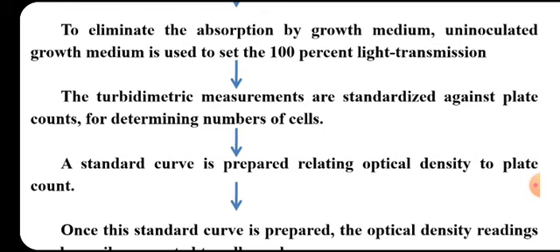That means if you have 10 raised to minus 1 dilution, take 0.1 ml of 10 raised to minus 1 dilution, place it onto a nutrient agar plate, say for example, spread the suspension, incubate the plate, and next day you will get the number of colonies. So this is how we determine total viable count.